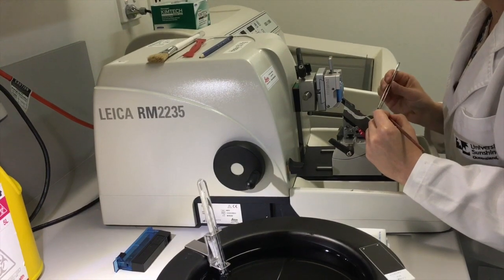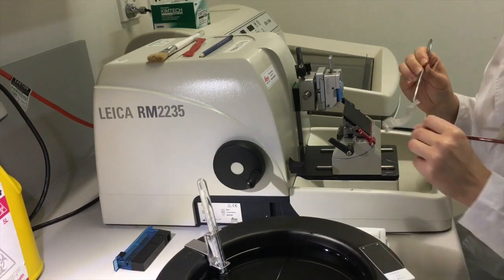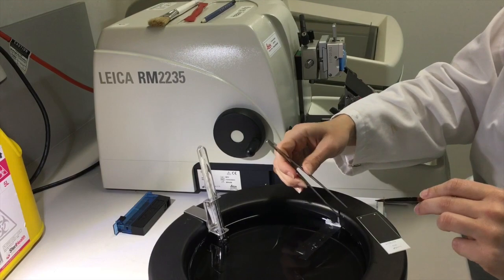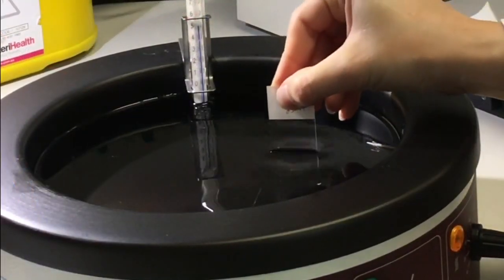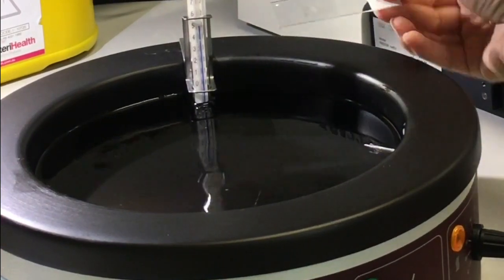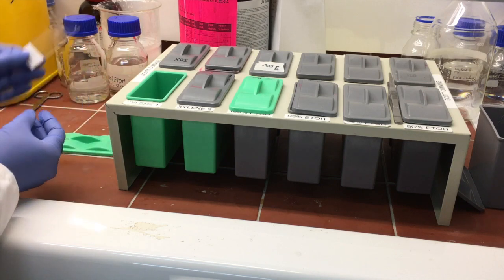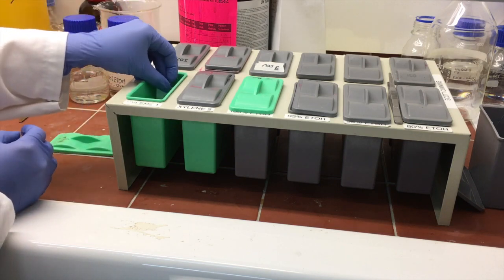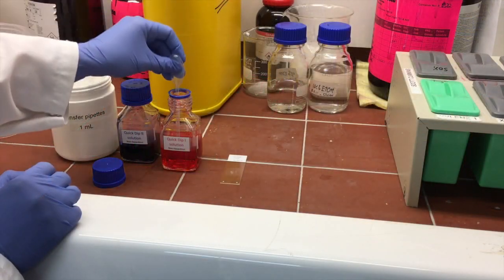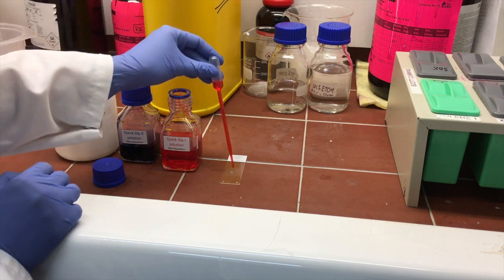The warm water in the water bath allows any wrinkles or creases in the tissue section to be smoothed out, so the section is nice and flat. The section can then be picked up from the water bath and placed onto a glass slide. Once the section is on the slide, the wax supporting the tissue can be removed and the tissue can be stained using dyes so that we can visualize the tissue structures from our section under the light microscope.